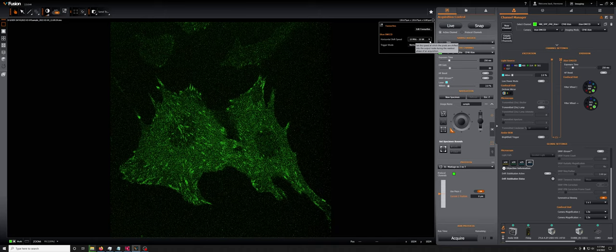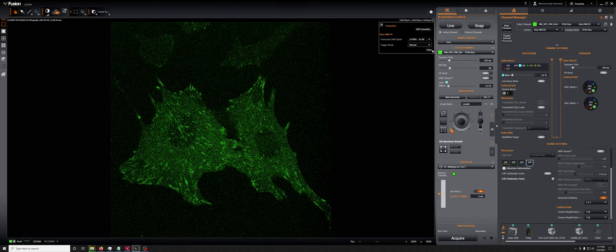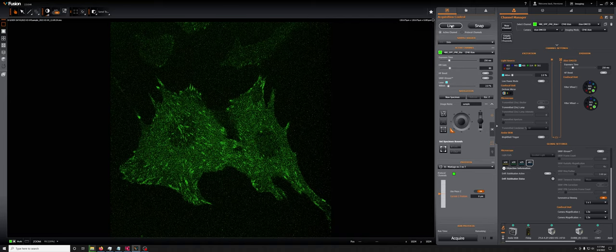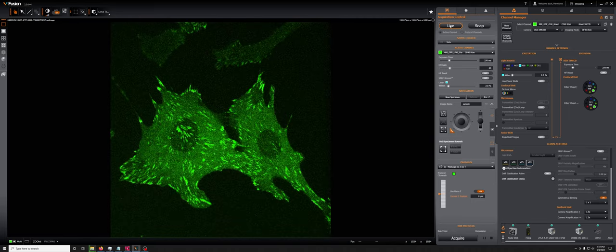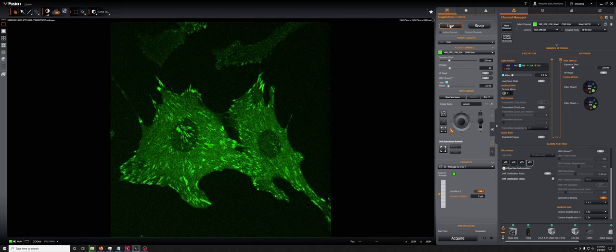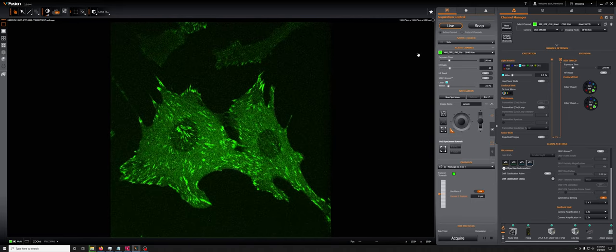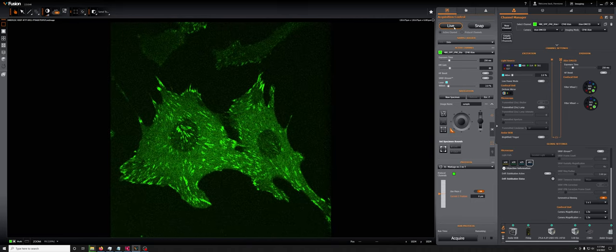If you're looking at things where speed is not a major consideration, you might want to consider whether doing this is a worthwhile change. So for example, here we were at 30, now we're at 10. You can see there's a little bit of improvement.